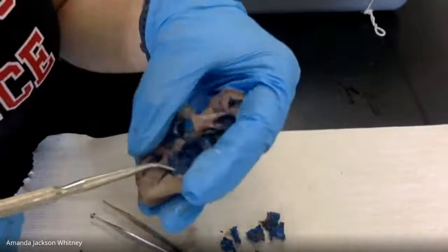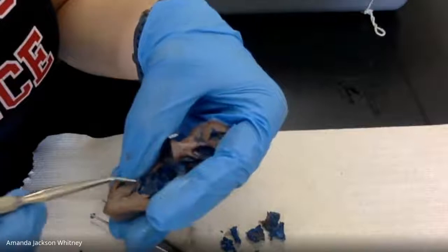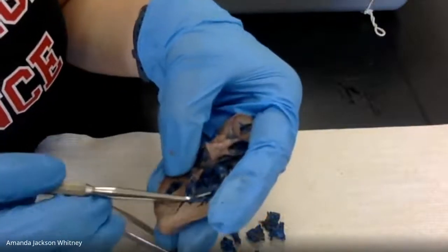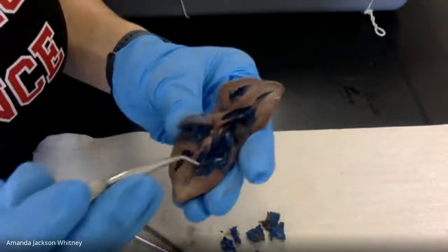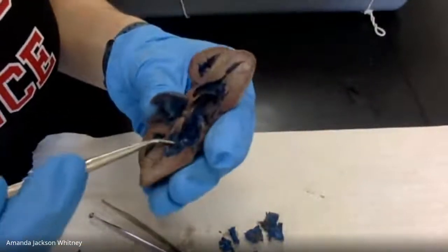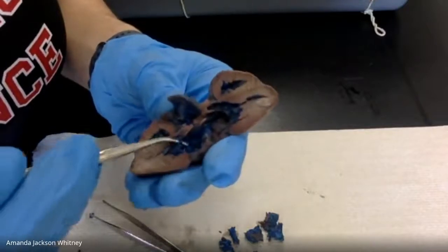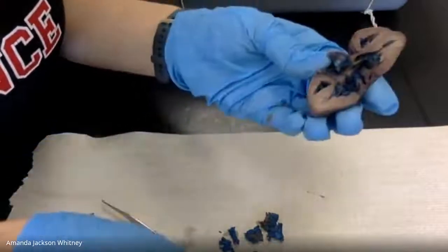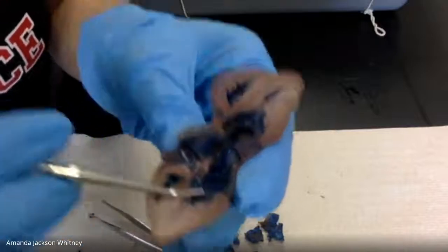So usually I have a much better shot of these. I've got a really great picture of these from last quarter, so I'll make sure I share that with you guys. But in between all of these different chambers are the valves, right? And in order to keep the valves in place, there's these little heartstrings, kind of what we call them, that are making sure that the valve doesn't fly too far back and allow blood to flow backwards. So here are some of those.